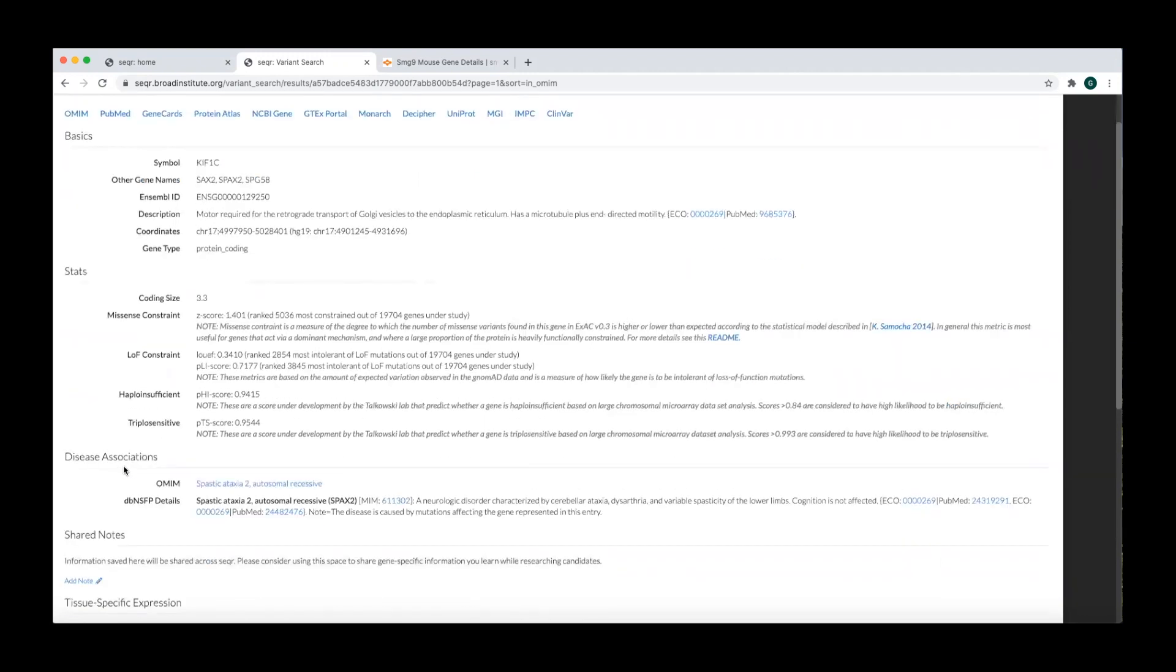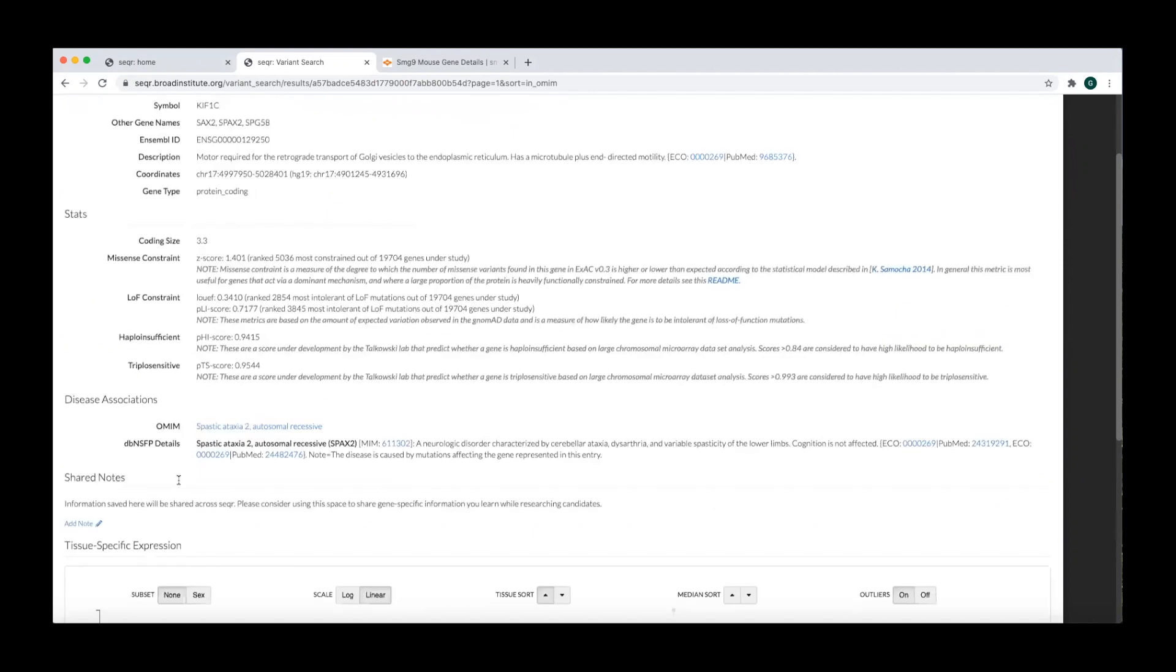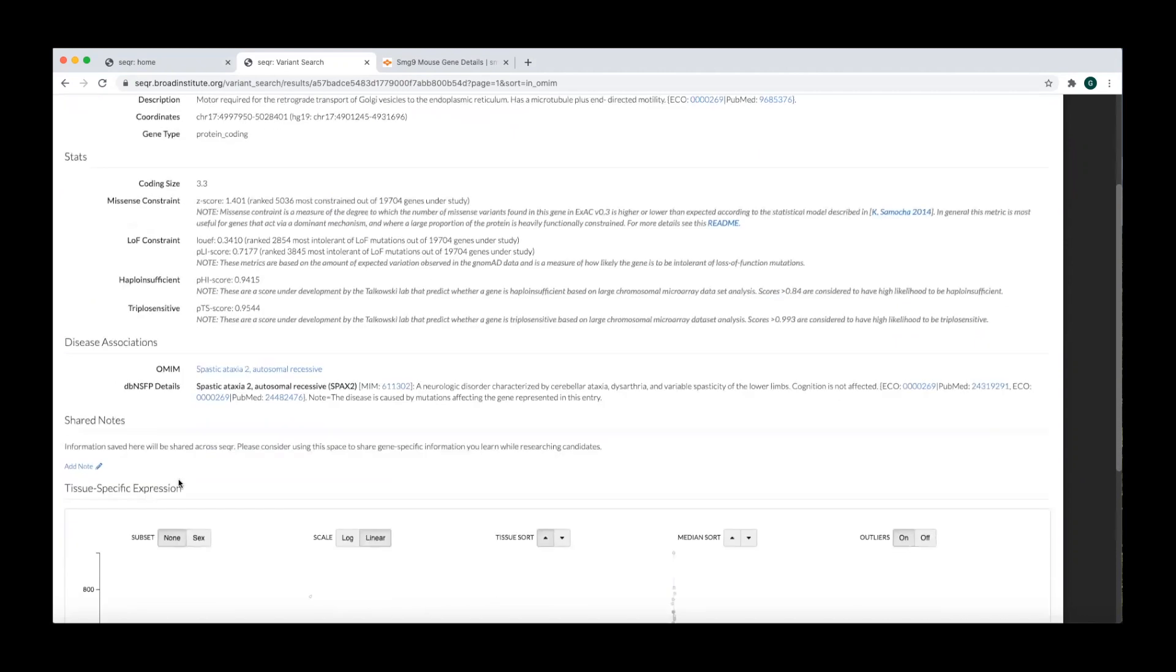In the disease association section, you can see reported phenotype associations in OMIM, which is an online compendium of human genes and genetic phenotypes that is freely available and updated daily.